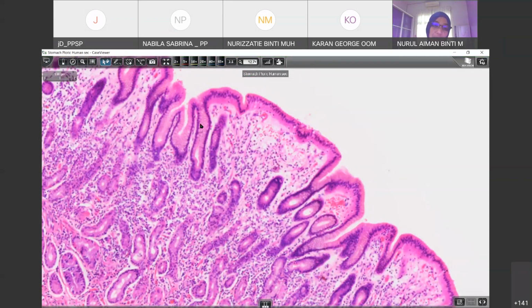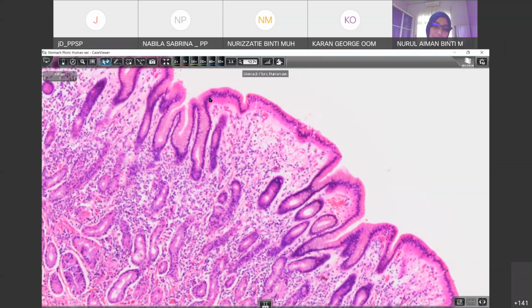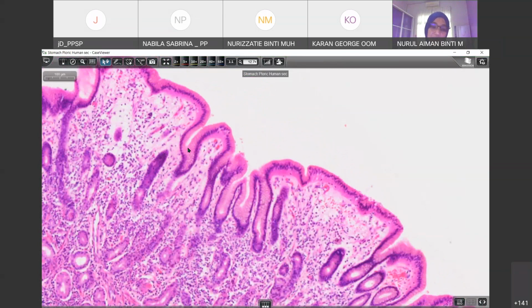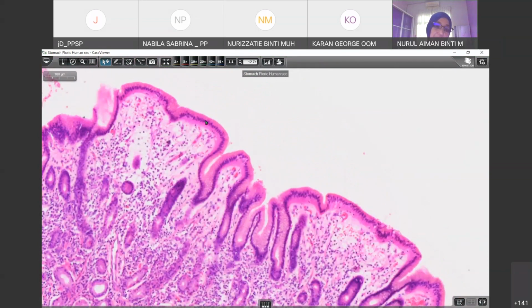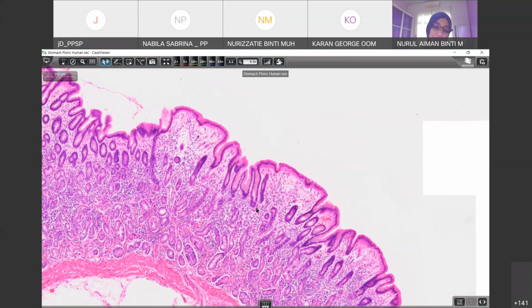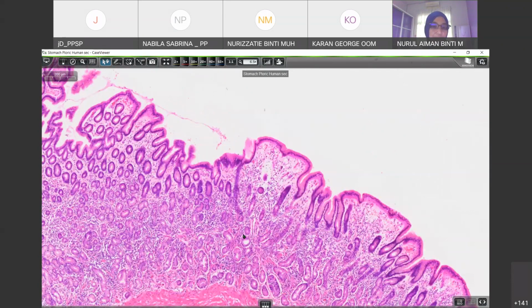It's a tubule. So in the stomach they don't have the ductal portion, because the rest of the gland and the rest of the epithelium have their own function to secrete mucus or whatever product that you may learn inside the gastrointestinal system. So these are the simple tubular glands. Sometimes it reaches until this area, but actually it's very deep inside. It's just that because of the arrangement, you don't cut through the rest of the glands until this area. So this is the simple tubular gland.